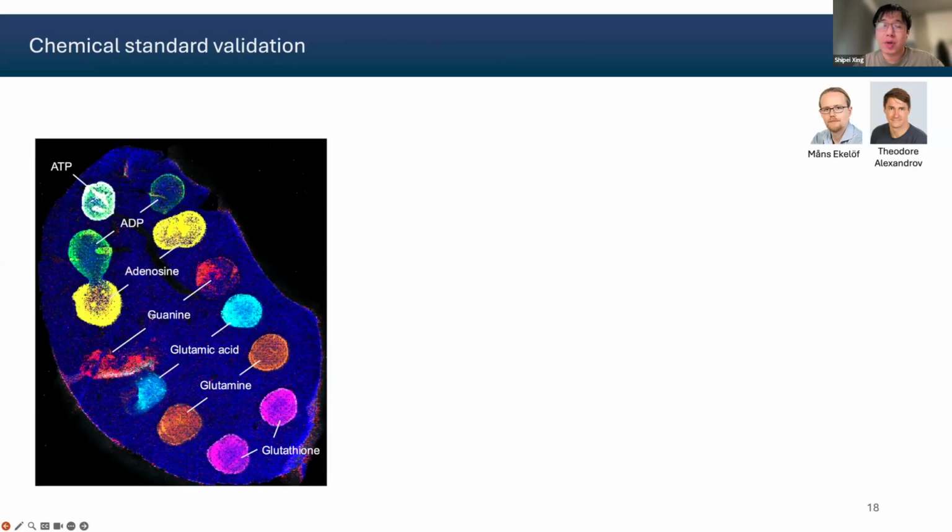Eventually, except for guanine and glutamic acid, all the other 5 standards could be confidently annotated. These 2 cannot be annotated because they have very low m/z values, and we do not observe their in-source fragments in the collected m/z range, because for a common imaging experiment, people will start to collect m/z from 100 or even 150 or 200.